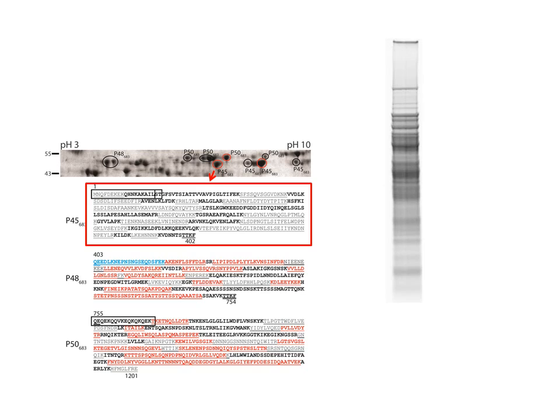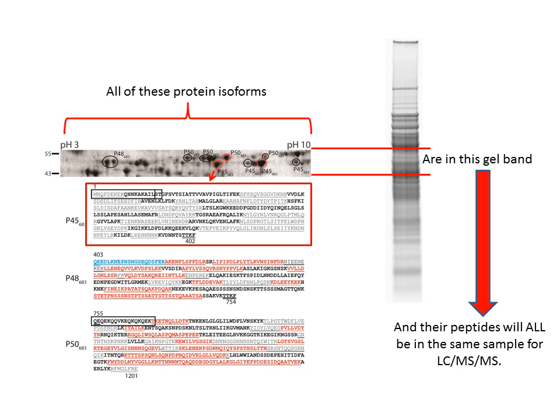probably saving cash. Another advantage is that the proteins are kept intact throughout the fractionation and are resolved into isoforms with observable pI and molecular weight values, such as these cleavage products that result from the organism processing its own proteins after they are made. When the protein molecules in a spot are in-gel digested with a protease such as trypsin, the resulting peptides will be from a single protein, in contrast to peptides from multiple proteins that will be present if proteins are separated by 1D SDS-PAGE, where the proteins are only separated by size.